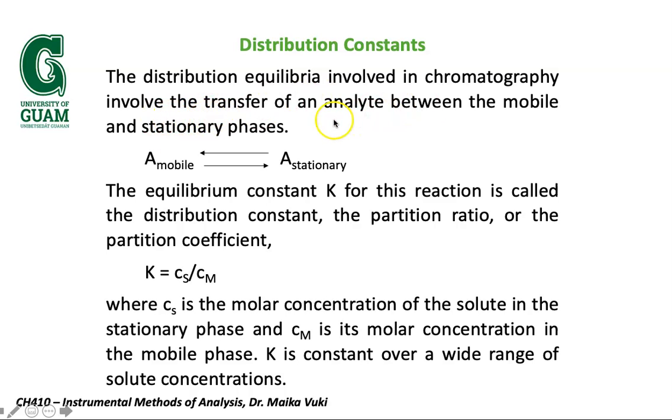You're looking here at the analyte in equilibrium between the stationary and the mobile phase. Now, we know this is a process undergoing constant change, so it may not be ideal to consider equilibrium, but we can make it an assumption on a micro scale, when we're looking at very, very small regions within the column. You would expect this sort of exchange to be in equilibrium.